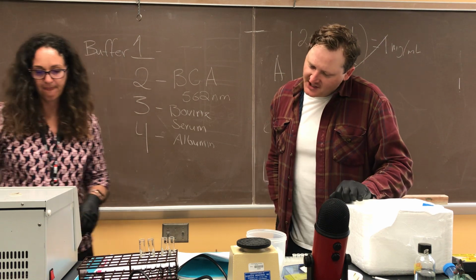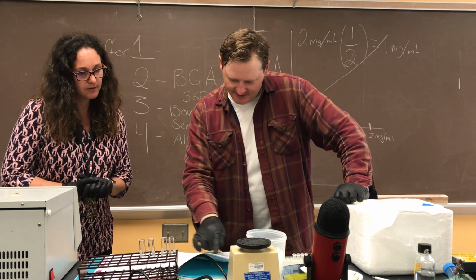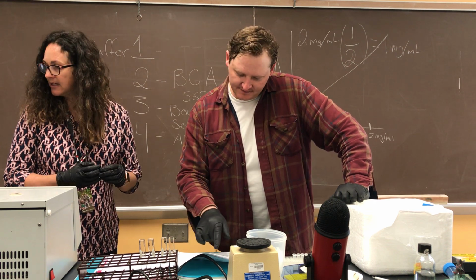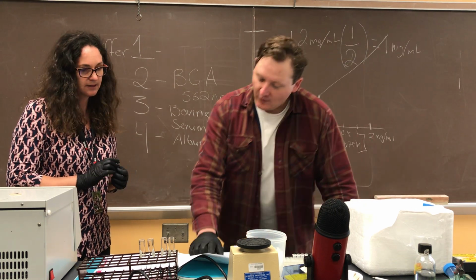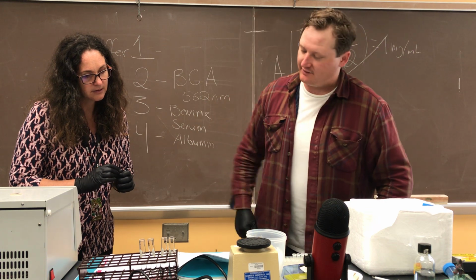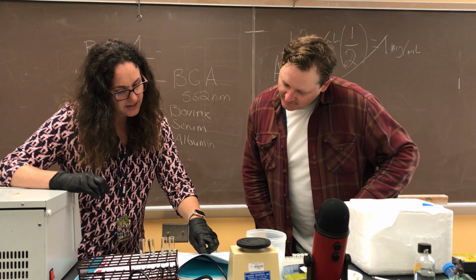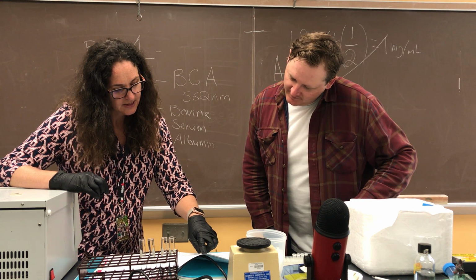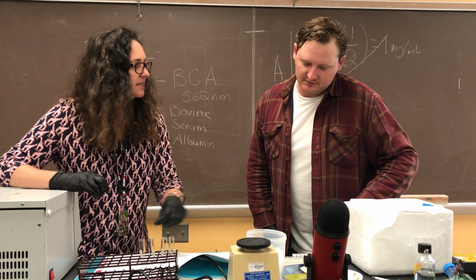Do we remove the fluid in this step? I don't think we do. Yeah, we do. Oh wait, we use the liquid. We get rid of the debris at the bottom. Yeah, but at this point we're supposed to take off the liquid too.